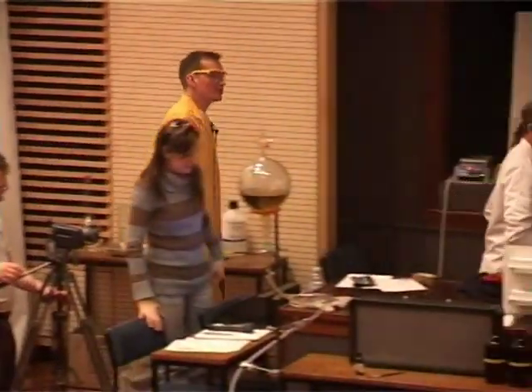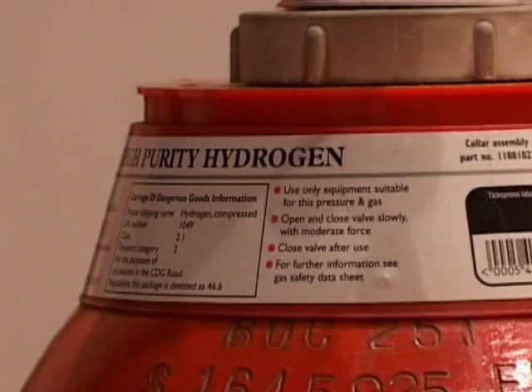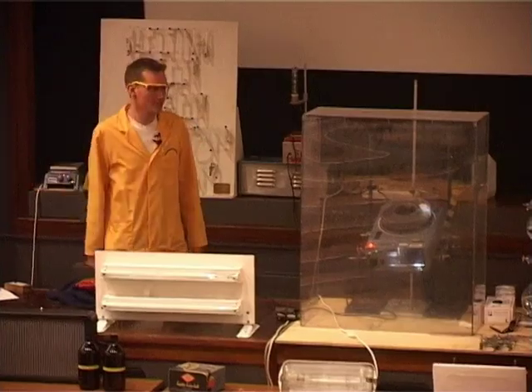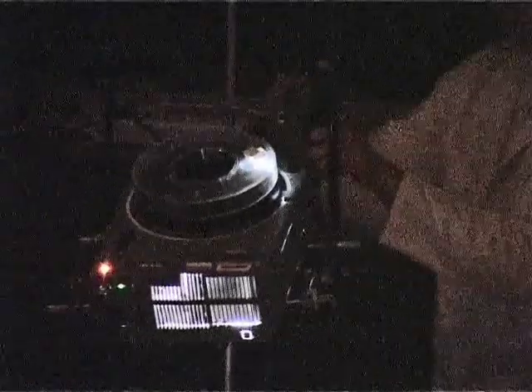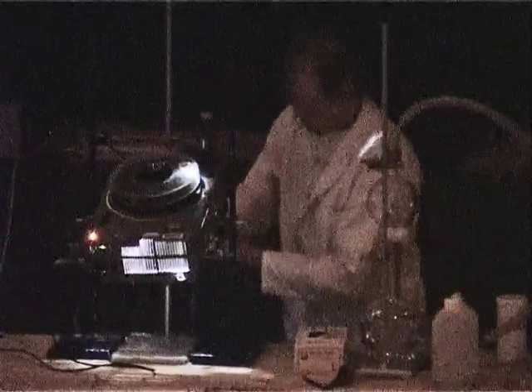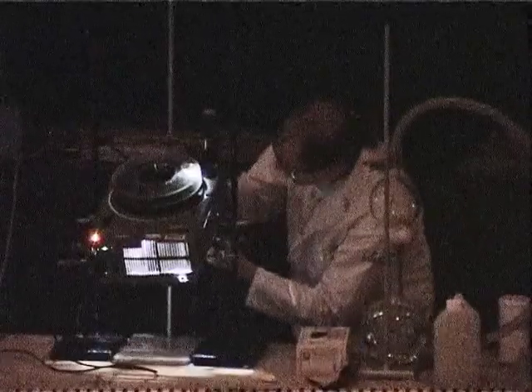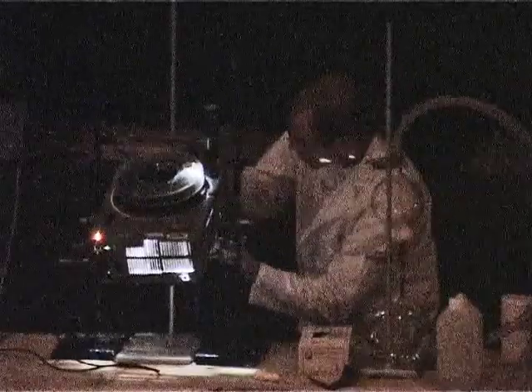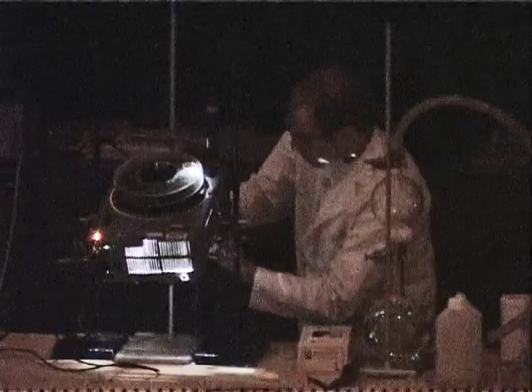We've got some tubes containing two gases mixed up. We have the gases hydrogen and chlorine. Okay, can I have the lights down, please? We have to be very careful here because the light, we hope, will set this reaction off. Now, Chris is just putting the tubes in front of the light source here. I say, inside the tube we have hydrogen gas and chlorine gas. Now this is fine until we put some light energy into this.